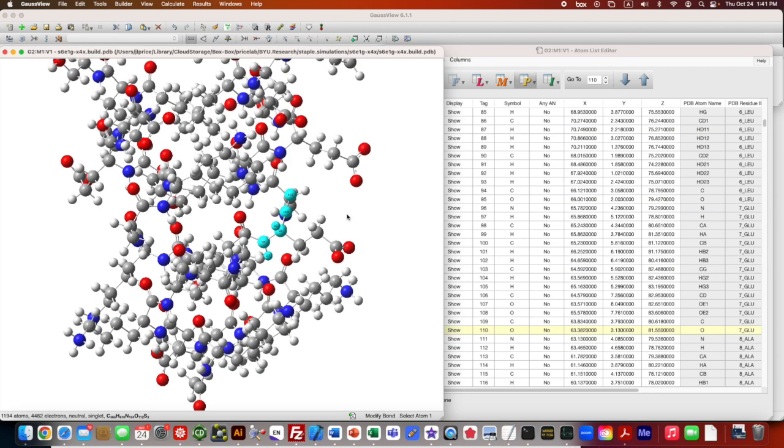And all we're going to do at this point is delete the unhighlighted atoms. So to do the whole thing. Just kidding. Yes, everything except that, no, sorry, of that side chain. Yeah. Thank you for that clarification.